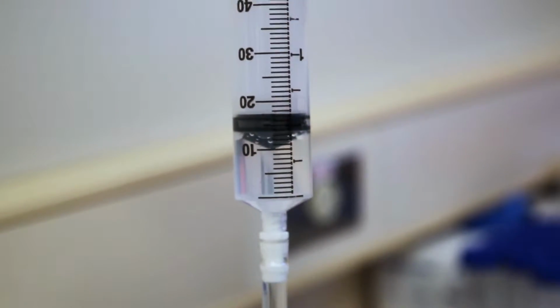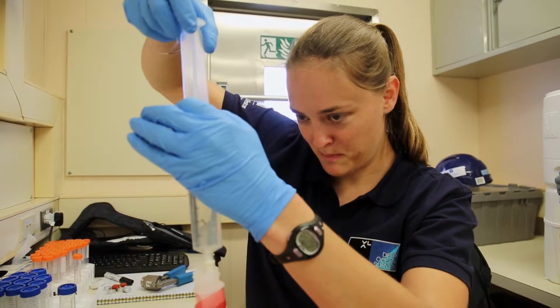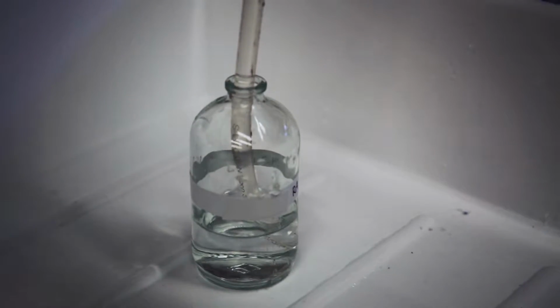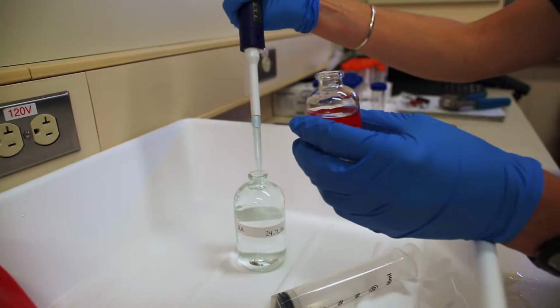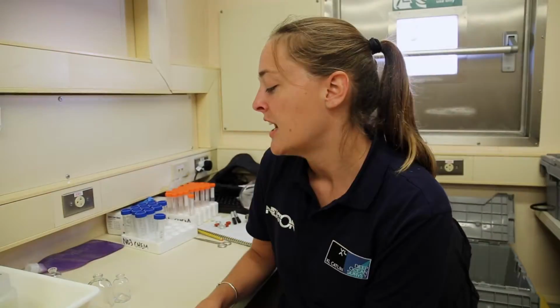I sample alkalinity in a bigger volume, and alkalinity is the buffering capacity of seawater, which is important especially in the realm of ocean acidification, which a lot of people are familiar with. Buffering capacity would be how the seawater can actually respond to those additional hydrogen ions as a result of atmospheric carbon dioxide. And then I measure dissolved inorganic carbon and C13 isotopes, which hopefully later on we'll be getting coral tissue samples that will also have C13 measured in them, so we'll be able to compare the water chemistry to that of the actual organism's tissues.